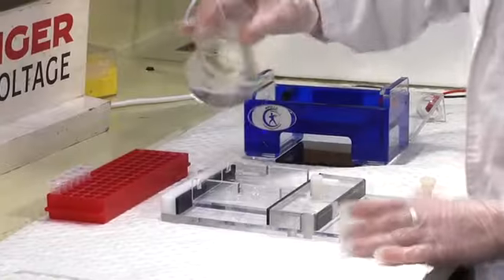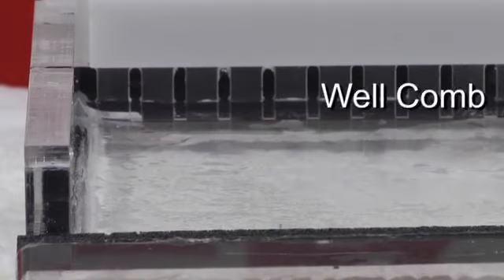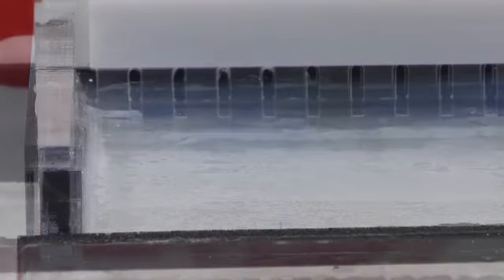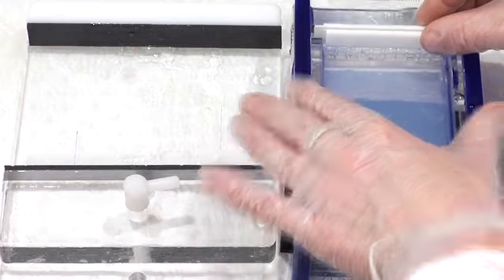So first we've got to make a gel. We just pour melted agarose into a gel caster, we add a well comb to make the wells, and then we leave it to set. Once our gel is set, we just put it into the gel tank. The tank contains a buffer solution which is hooked up to positive and negative electrodes.